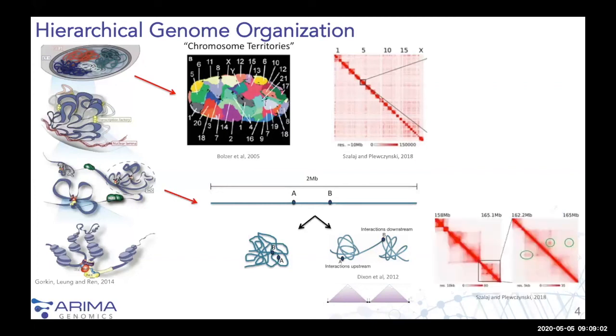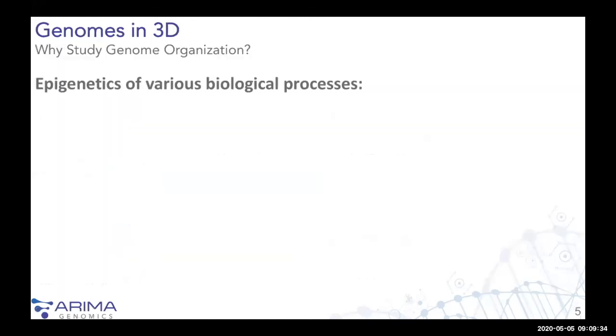And what does that data look like? When you look at Hi-C data here, this is about a 7 megabase region. This sort of self-interacting domain that I'm highlighting with my mouse would be one contact domain, and then a neighboring contact domain here. And then when you zoom in, like I said, onto a whole other log order increase in resolution, you see these dots on the Hi-C map, which themselves represent very frequent point-to-point interactions between two regions along the linear genome.